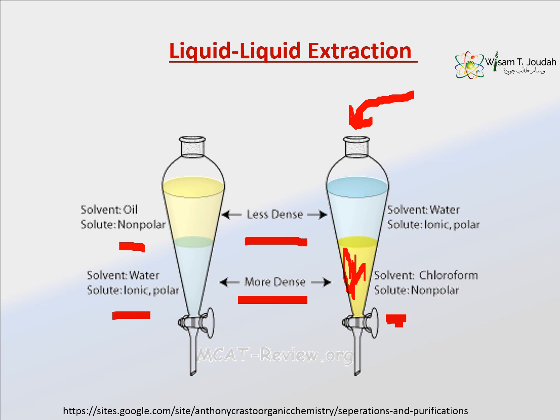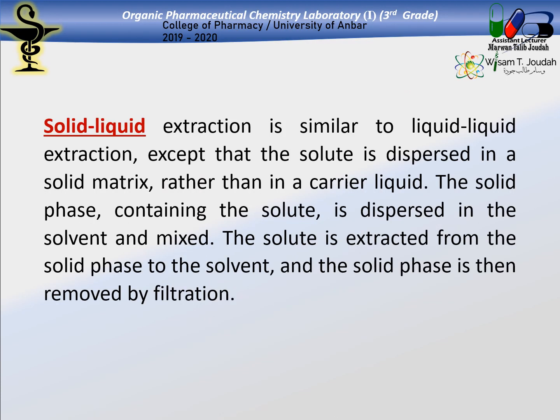Okay. Let's move to the solid-liquid extraction. It's easy. After you do the mixing and you end up with a solid and a liquid, it's easy to separate them using a regular filtration process.